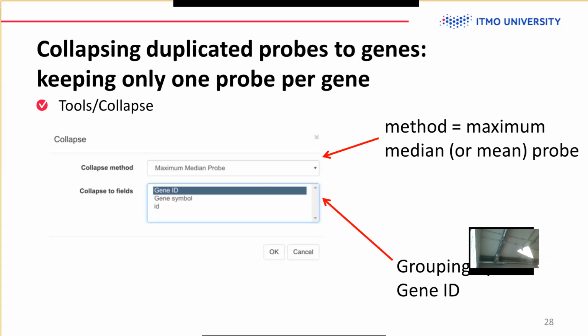So in most cases, you want to go for protein coding genes in particular, do the analysis there, and then if you don't see anything in particular, or if you wanted to look at isoform change from the beginning, you can try to work with isoforms. But it requires a different experimental design.